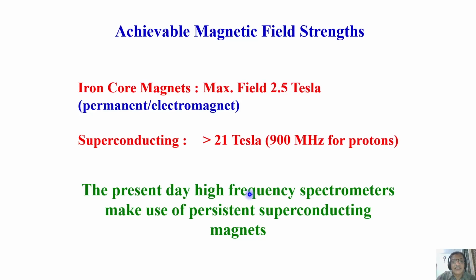So long as you maintain the liquid helium temperature, the coil is immersed in liquid helium at the superconducting temperature, the magnetic field always exists because the current you have passed once keeps on moving. Current will always be present. It is called a superconducting state. That means there is no opposition for the flow of electrons. The current, once you pass and generate the magnetic field, persists forever, so long as you maintain the superconducting temperature.